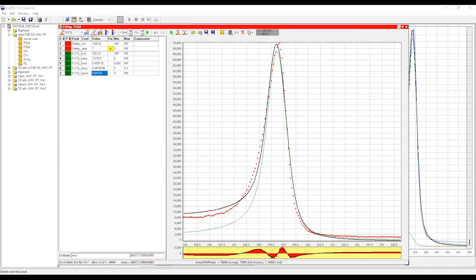So silver is used for checking symmetry and also intensity. We know what the signal should be from a clean silver surface when we have some photon flux, like 40 watts or something. So we check if the intensity is reasonable. If the intensity is very low, it means that from time to time we need to change the anode in the X-ray source. We already did it once.